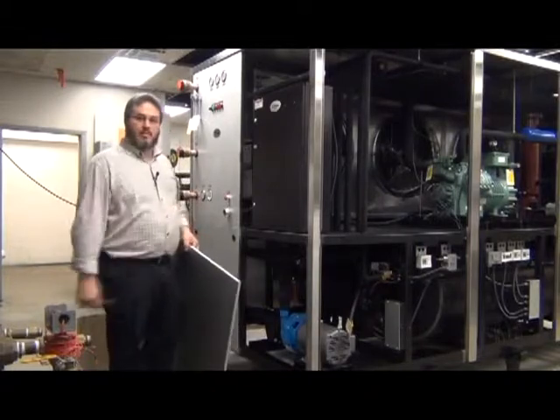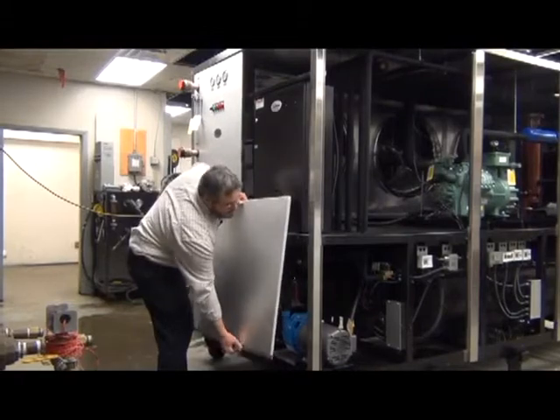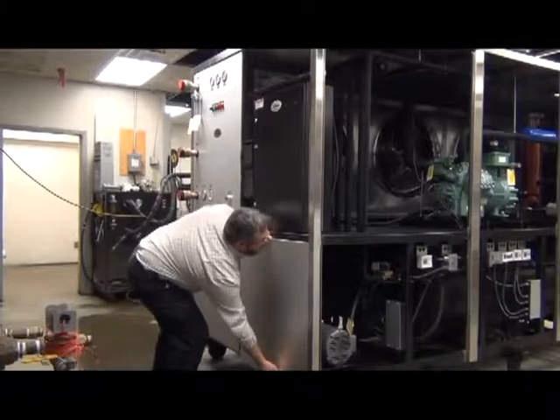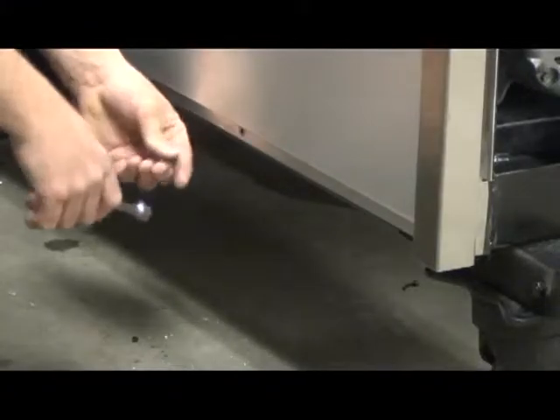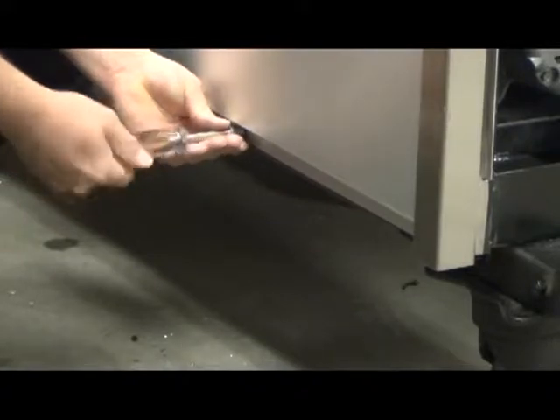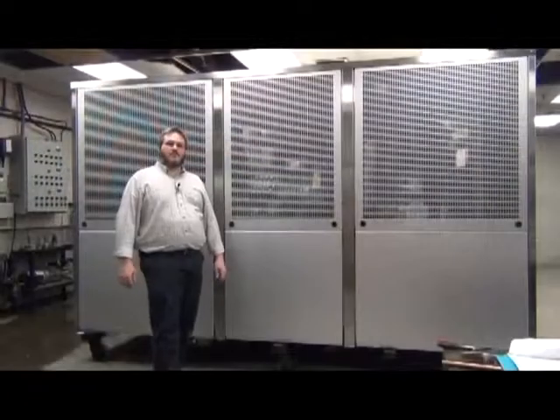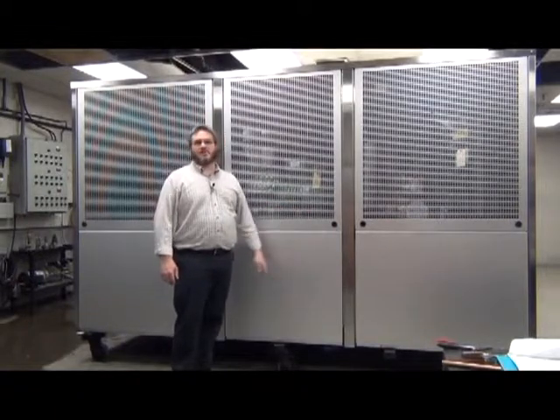Now we'll go ahead and reinstall all of our panels, starting with the bottom panels first. And you just reinstall the panels in the same order, or the reverse order, from where you took them off. Now that we have everything all closed up, this concludes the startup procedure for the chiller.